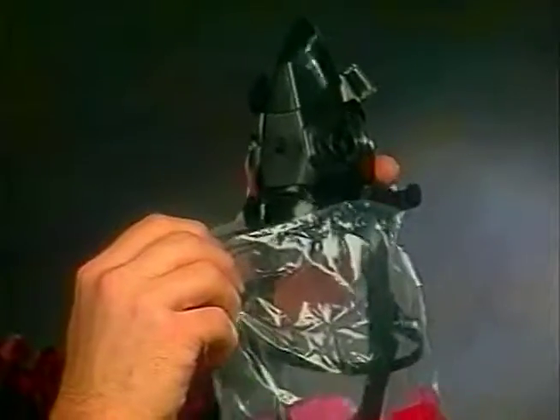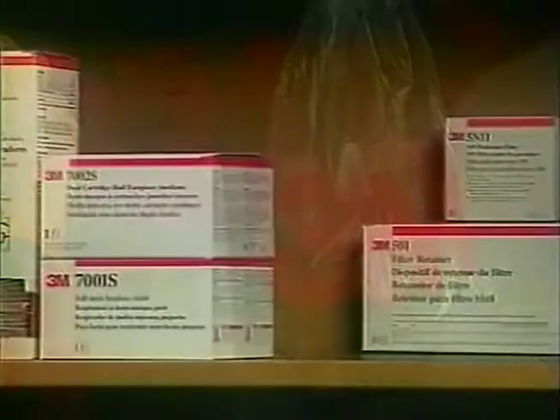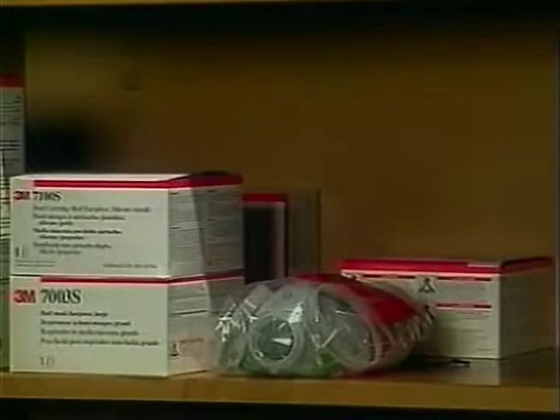Between uses, the respirator should be stored to protect it against airborne contaminants. The easiest way is to store the respirator in a sealed plastic bag. Most chemical cartridges contain activated charcoal. If the respirator is left in the atmosphere, it will continue to work by absorbing humidity or chemical vapors, reducing the life expectancy of the cartridges.